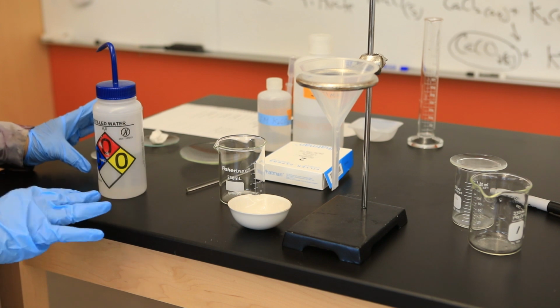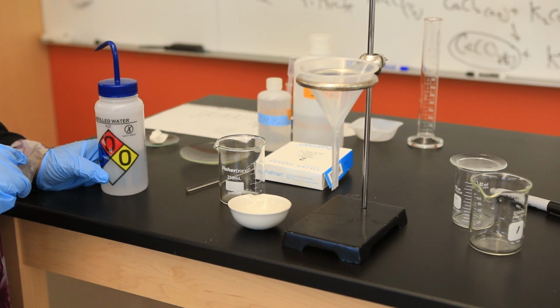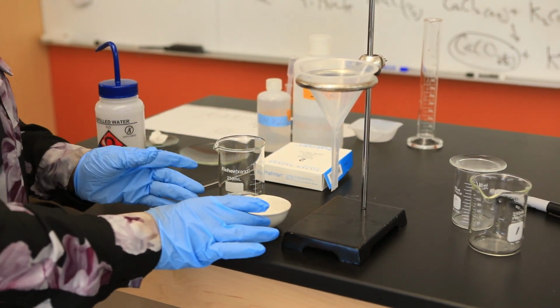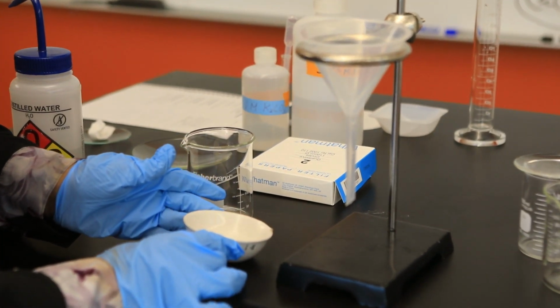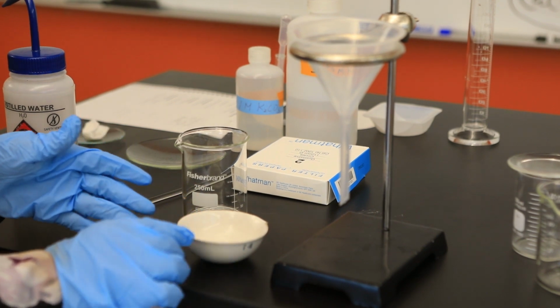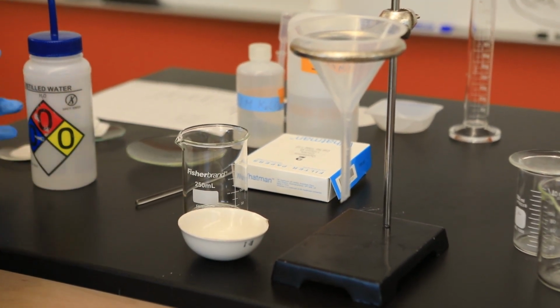I'm letting it settle for a few minutes because I'm trying my best to avoid removing any of the calcium carbonate. Maybe some sand will transfer over when I decant, but in this part of the experiment, no matter how hard you try, calcium carbonate is a bit challenging to recover.